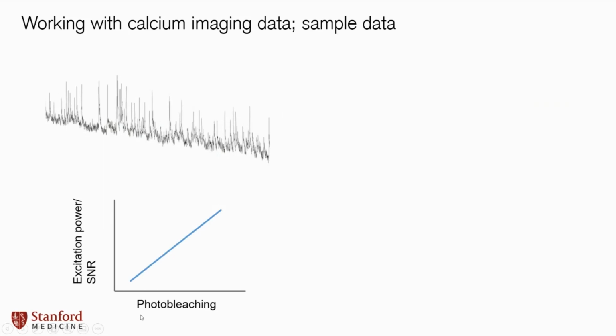The bonds within the GCaMP molecules will spontaneously flip out or break. So when you're thinking about these experiments, you're always doing a trade-off between how much excitation light you're passing in, and your signal to noise ratio, and how that affects photobleaching and this downward trend. But the principle I've been using for my work, and it works really well, is to have a series of ultrasound stimulation events, let's say. And I don't know if you guys can see my mouse. I hope you can, because I've been using it a lot.